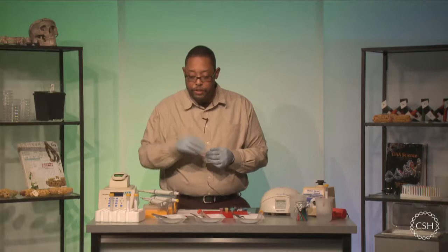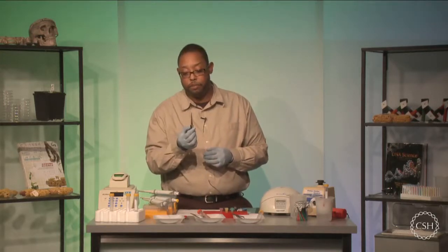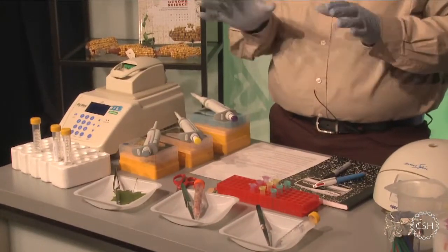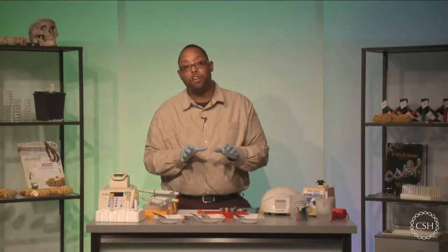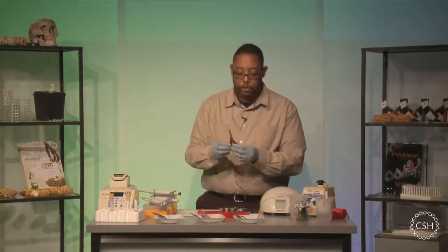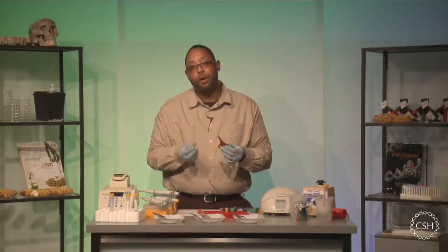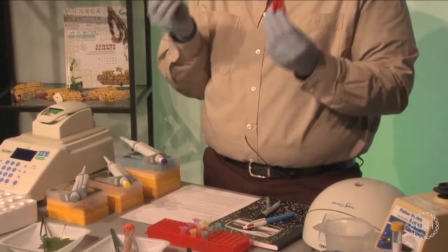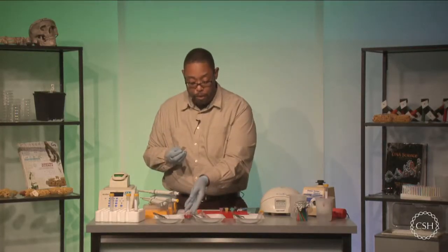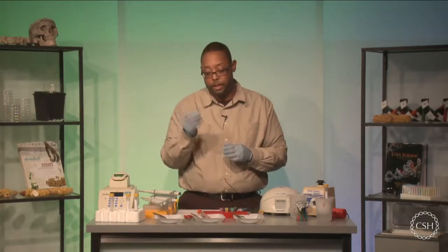All right? You're going to see that we need some forceps. And for each sample, I recommend having a clean set of forceps. Okay? You don't want to have any cross-contamination in the experiment. So please make sure all these utensils are washed and autoclaved before you get started. Okay? You will also need a pair of scissors or maybe even a razor blade. This will allow you to cut tissue or separate tissue very cleanly, but make sure that these also are cleaned very well, either bleached or soaked in something that's going to remove any residual DNA that's essentially there.